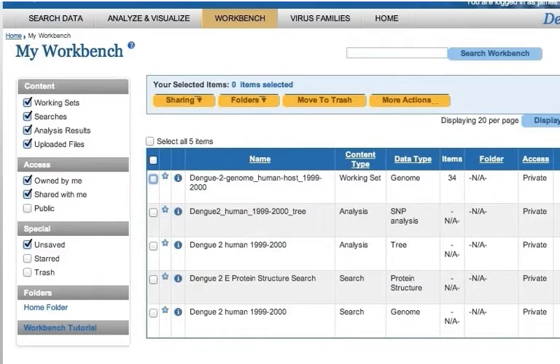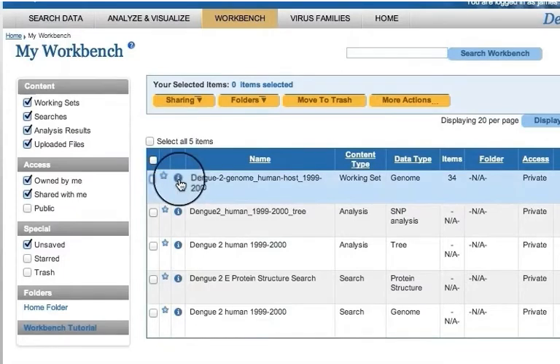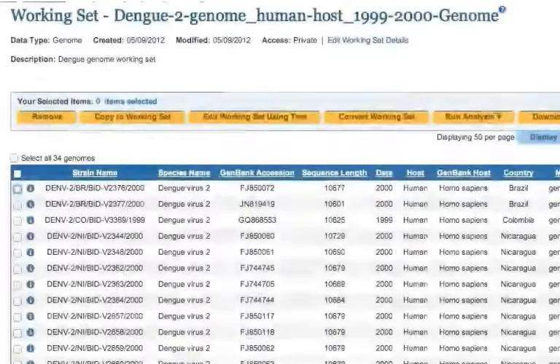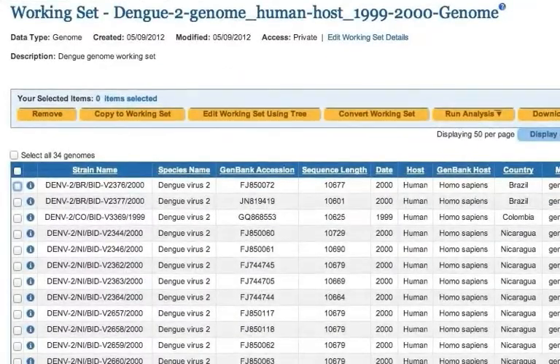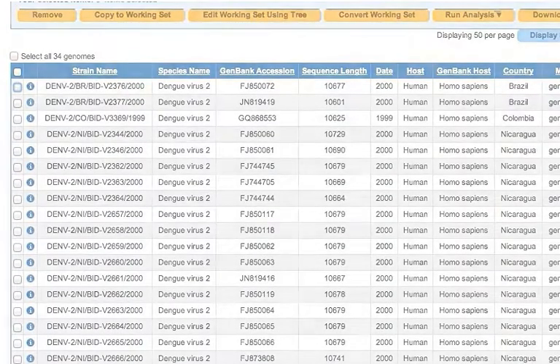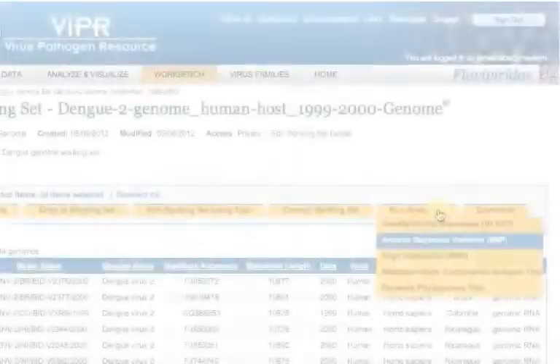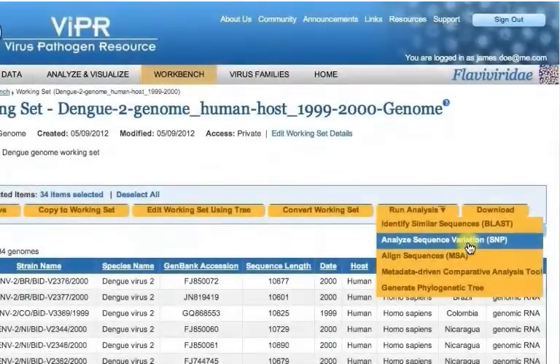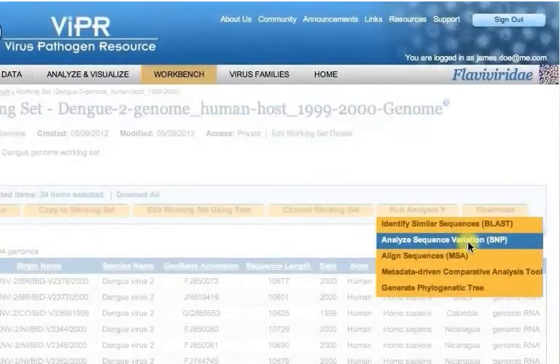To run an analysis, go to your workbench and click the blue eye icon next to the working set in the main workbench table. A new page will appear that shows the contents of the selected working set. Mouse over the Run Analysis button, then click a desired analysis.